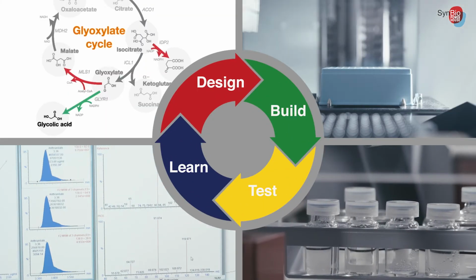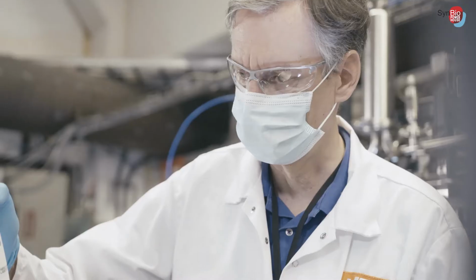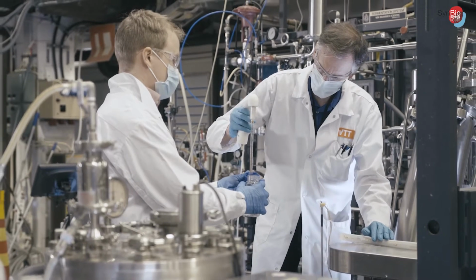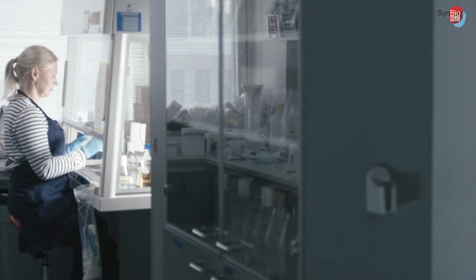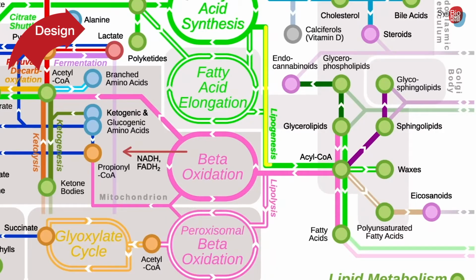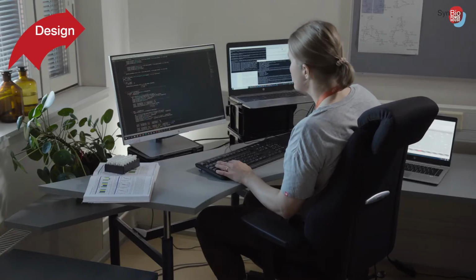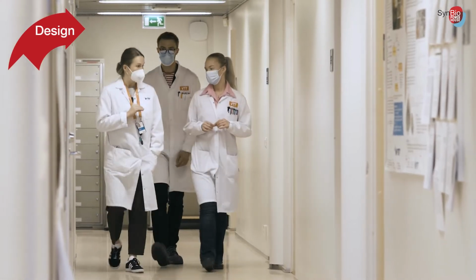At VTT, the infrastructure and know-how in biotechnology and synthetic biology build on decades of experience and excellent in-house facilities from lab to pilot-scale testing. Before doing wet lab trials, synthetic biology offers tools for predicting the outcome of metabolic engineering of an organism. This includes a fascinating area of computational tools, analytics, and machine learning for engineering biology. At VTT, Paula Jouhten's team is specialized in this highly complex field of science.